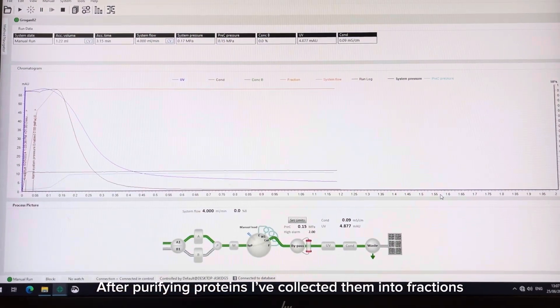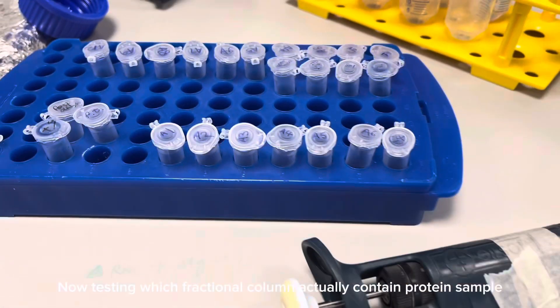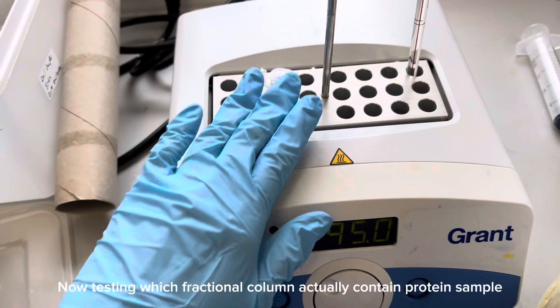After purifying the protein, I've collected them into fractions, so I'm just testing out which fractions actually contain the purified protein sample.